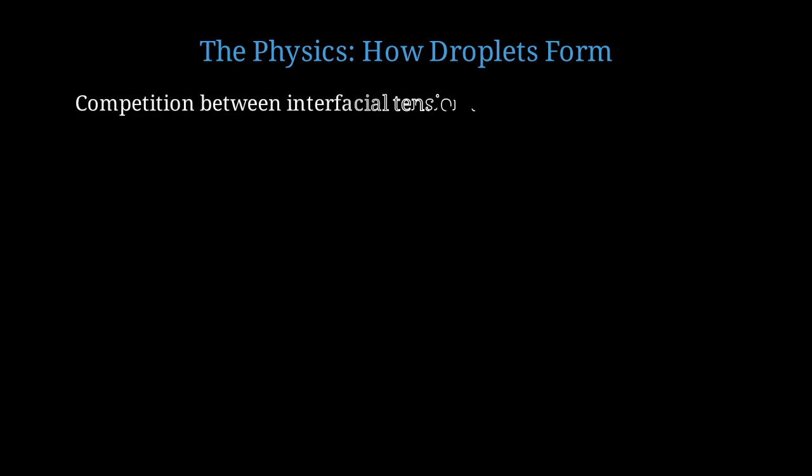Now let's understand the physics of droplet formation. What forces are at play here? Droplet formation is governed by a competition between interfacial tension, which wants to minimize surface area, and viscous drag forces from the continuous phase, which want to pull the droplet away. We quantify this with the capillary number.